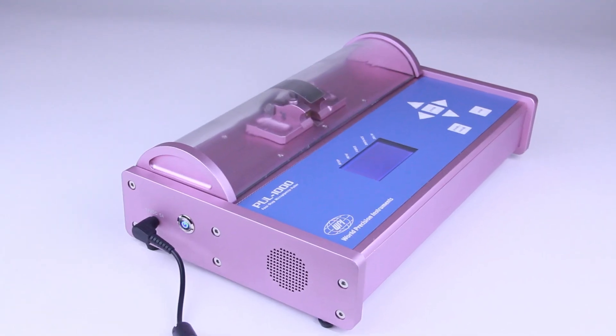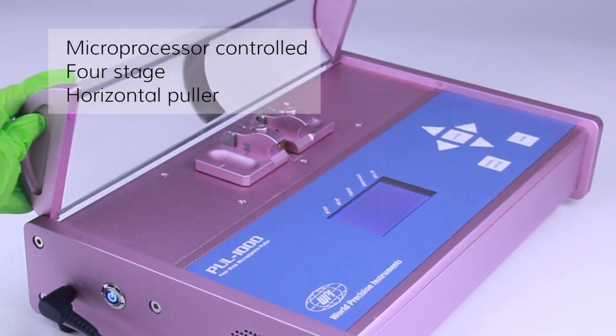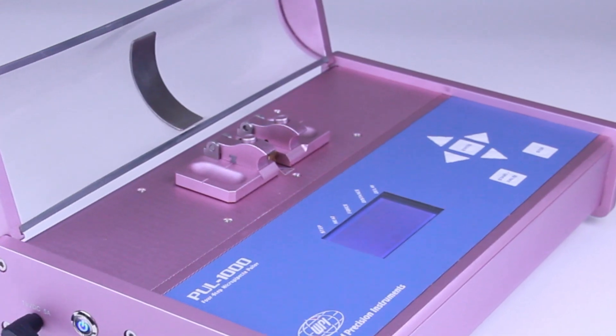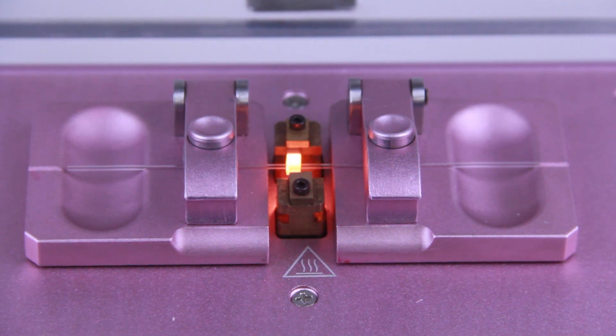Hi, I'm Lisa with another WPI technique. Today we're going to talk about pulling glass with WPI's new micropipette puller, the Pull 1000. The Pull 1000 is a microprocessor-controlled, four-stage horizontal puller for making glass micropipettes or microelectrodes, which are used in intracellular recording, microperfusion, and microinjection.